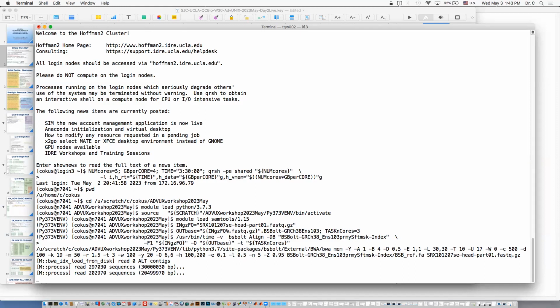So I don't think this takes too long once it actually starts the actual read alignments, because our pieces are only 500K. Like I said yesterday, for whatever your project is, you have to figure out what the right size pieces is, right? Here I'm just using alignment of whole genome bisulfite data in human as an example. But in this particular setup, a typical part size that you might actually use in a real run is 10, 20, 30 million read part sizes.